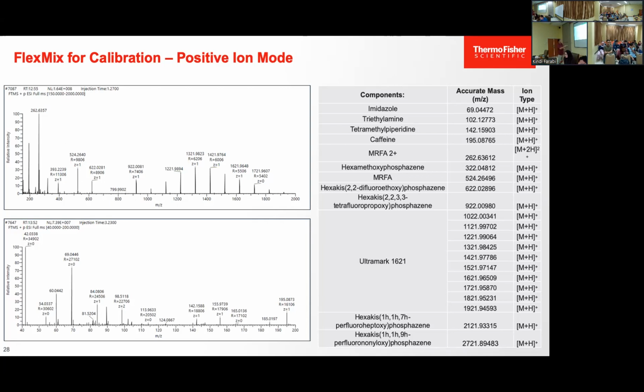And one example, you see M plus 2H, doubly charged. When you have doubly charged, the mass is smaller because mass spec detects the mass over charge ratio. So this is precisely an example of how the mass spec will be used for proteomics. It can be large molecule top-down proteomics or bottom-up proteomics.